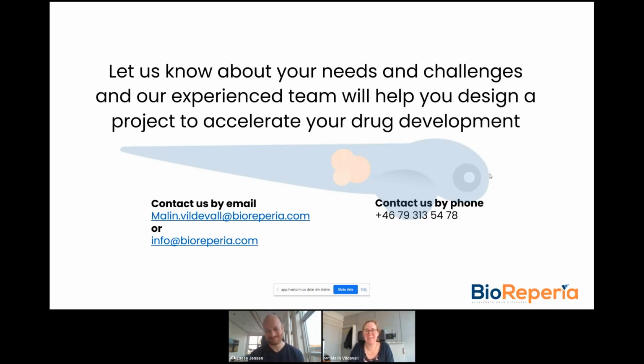Great, thank you, Lasse. And perhaps also in relation to this question, we have a question in regards to infiltration of lymphocytes into the primary tumor, and whether or not that can be evaluated in the ZTX model, and how it might be affected in the presence of immune checkpoint inhibitors?